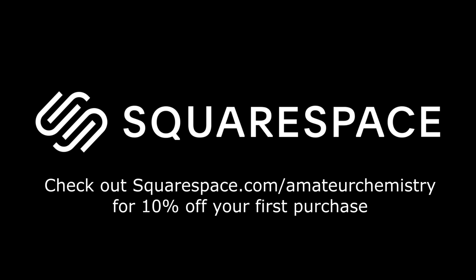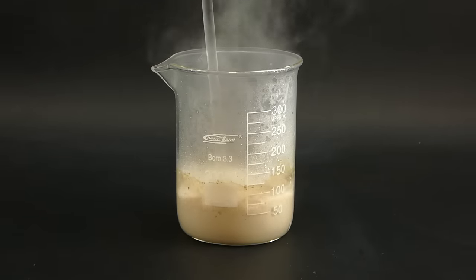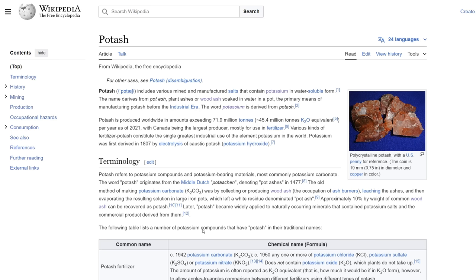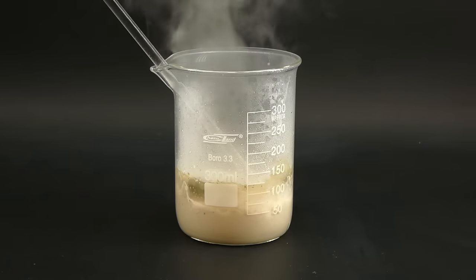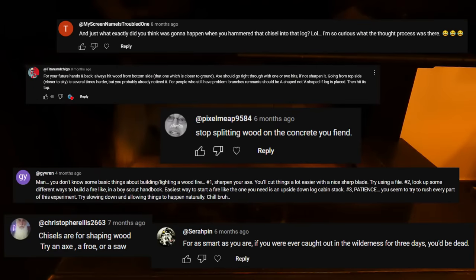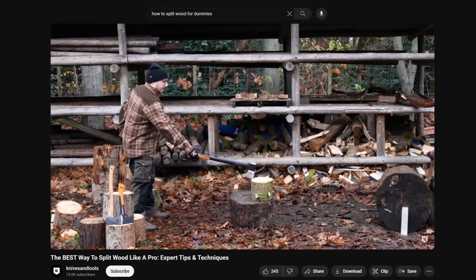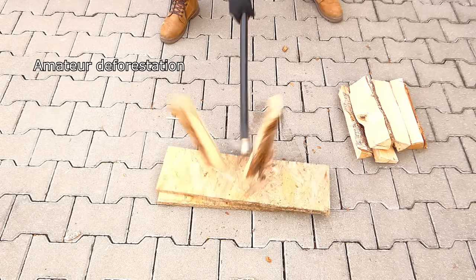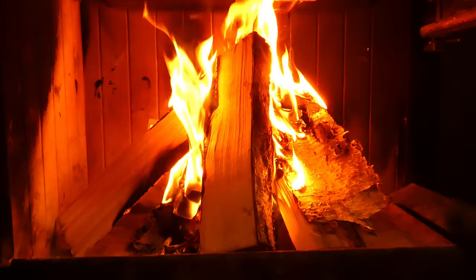Anyway, to make the potassium sulfate I first have to turn wood into something called potash, which is a crystalline material obtained by leaching ash with water. To start I of course have to burn some wood and I will be doing that in my trusty home fireplace. Also after so many people told me that I can't split wood in the nitric acid video I decided to improve on that and actually watch a tutorial. So I hope that now I am doing it better.